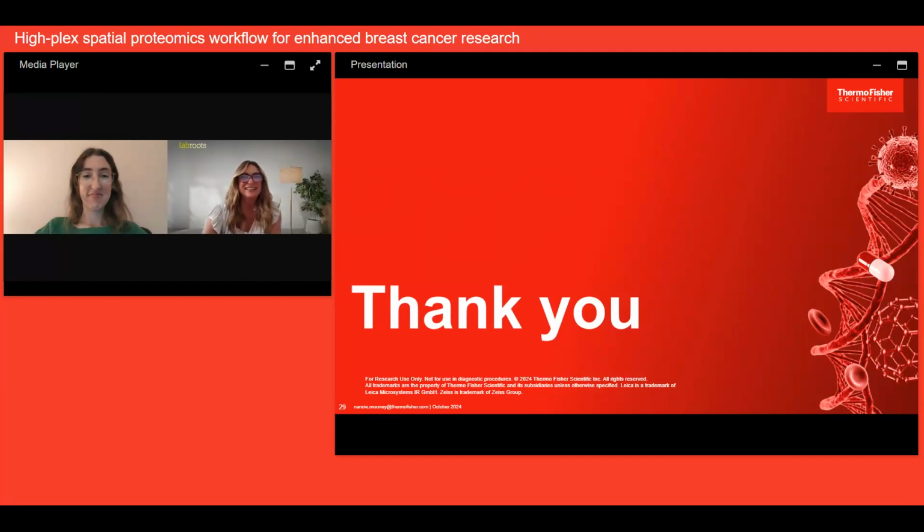Yes, please. So another question that came in, it says, is there a dedicated page on Allura dyes specifications and spectrums? And I'd like to let them know that they can go to thermofisher.com/fluorophores to see all of the dyes that Thermo Fisher has, including the Allura dyes. And there they will find links to the Allura dye pages.